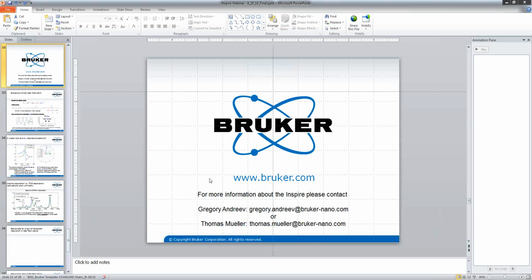What kind of tips are preferred or are used with this? Can you comment on the type of tips, frequency, coating, etc.? Yeah, so that's a really nice thing about this technique, is that the tips are already commercially available. There's only two specific characteristics that the tip in general needs to have. It needs to have a metallic coating, which is very durable. So for instance, platinum iridium works really well.